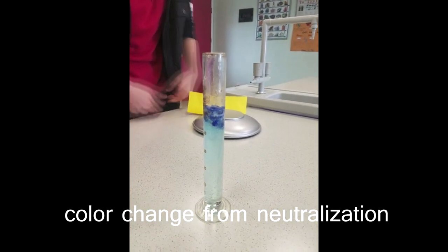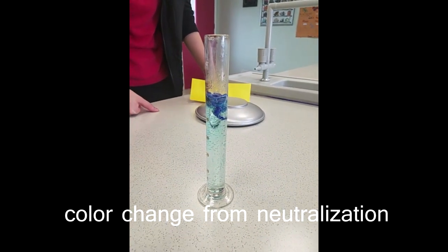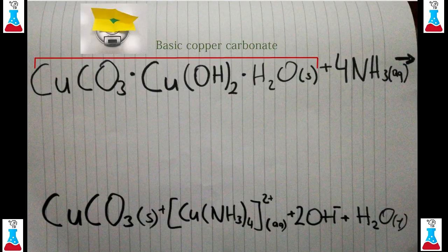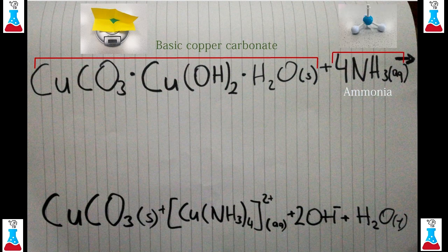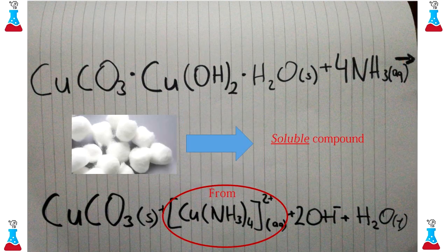This slowly turns white as the acid neutralizes the alkaline tetraamine copper solution and destroys the complex. The first step in the demonstration is a reaction of basic copper carbonate with aqueous ammonia to form tetraamine copper ions. When insoluble cellulose is added to this solution, it is converted to a soluble complex compound.